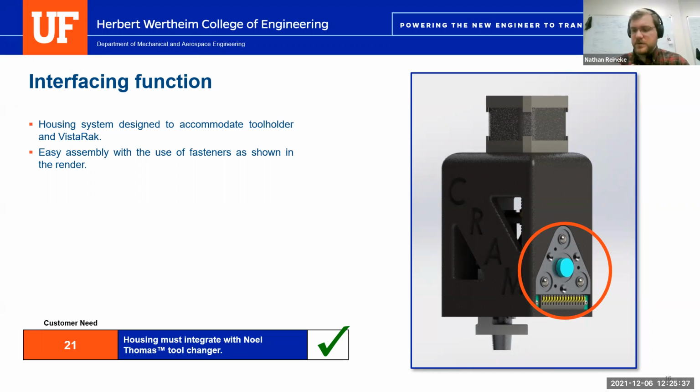In the future, I want to change the housing to a certain degree to add a trough or a channel where we can have the wires go directly up the side of it, either the corner or up the middle. This will keep the wires out of the way. Right now, they aren't in the way, but they are kind of an eyesore in that you can see them clearly through the side if you were in person. But mostly they just run up the side of the housing. I'm not sure if that answers your question. Yeah, I was just curious to make sure that you had some accommodation for that.